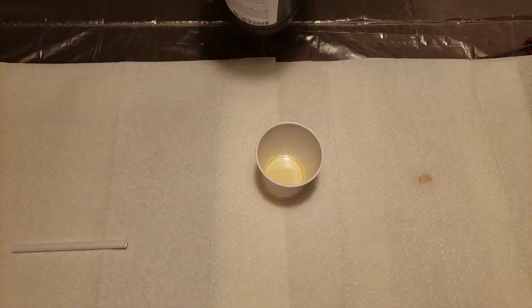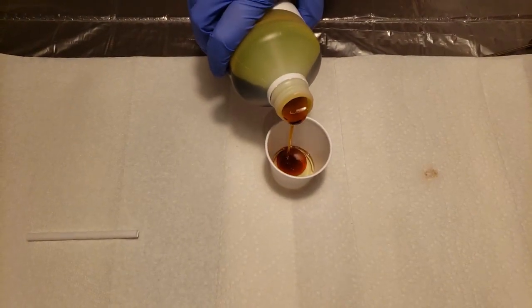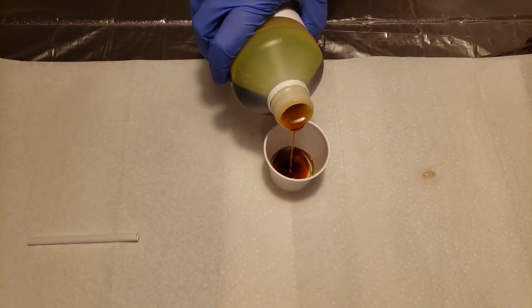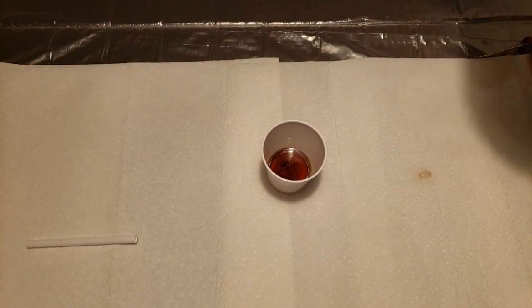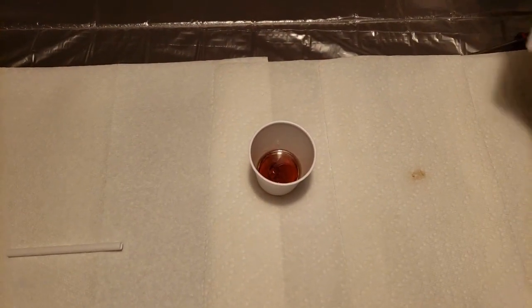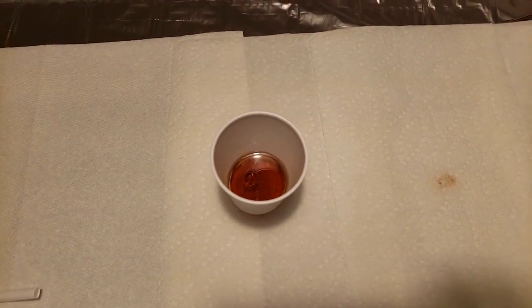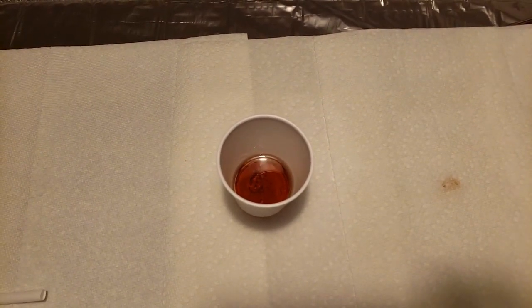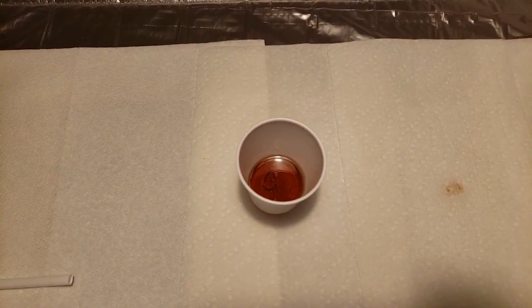Here is part B to our foam lab. You can see it's a different color — it's a much darker dark brown. We're going to put about the same amount in as we put in part A. It is much denser, which is why it sinks to the bottom, and it is very syrup-like, very thick, and viscous.